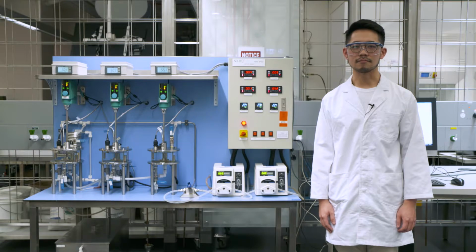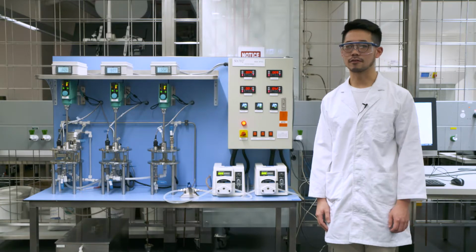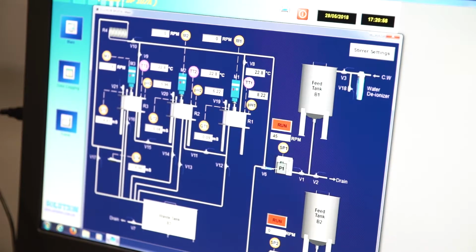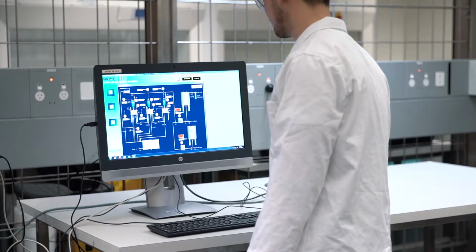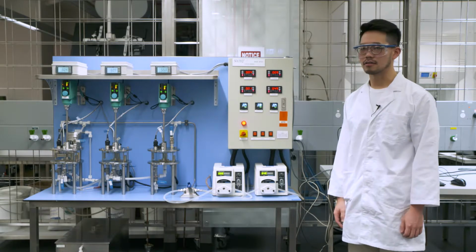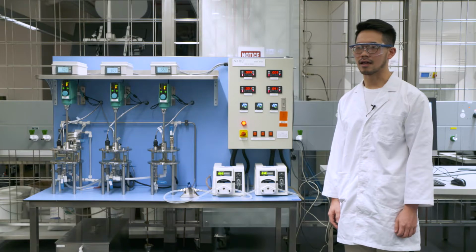Then switch on the pump P2. The speed of pump P2 is still 45 RPM. We can do it on the software. Okay, we will let the brine solution go through the whole system to remove any air bubbles in the line.